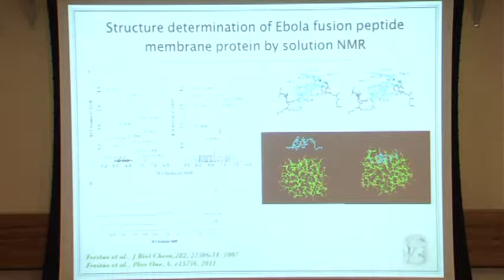Here we have two kinds of liposomes. Here is a liposome composed of four different kinds of lipids, and here is lipid raft that I extracted from cells. We observed that the peptide can bind to both of them, and the region responsible for that is this region, the same region that we believed, based on several data like fluorescence and molecular dynamics. Here is one molecular dynamics simulation using micelles, SDS micelles, the same mimetic environment that we used to solve this structure.